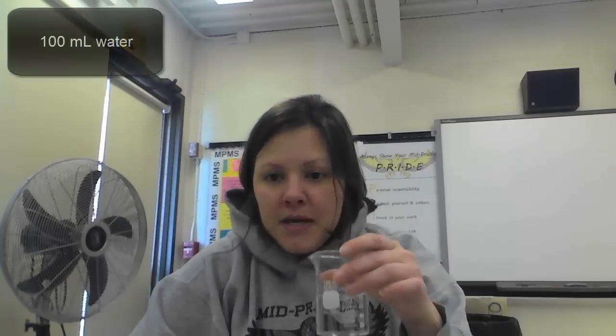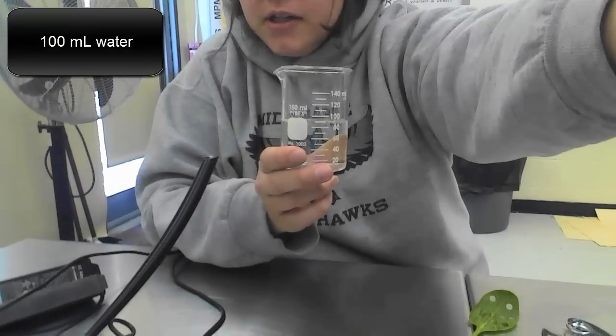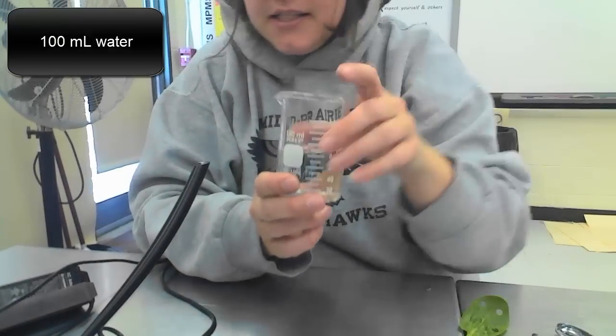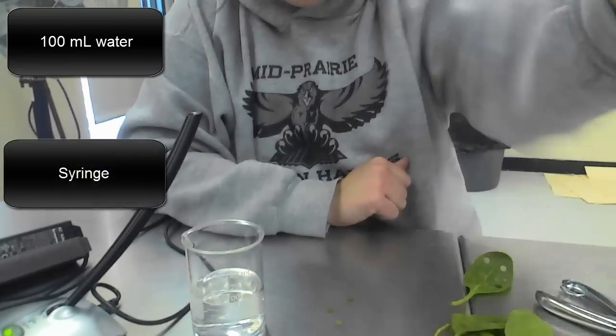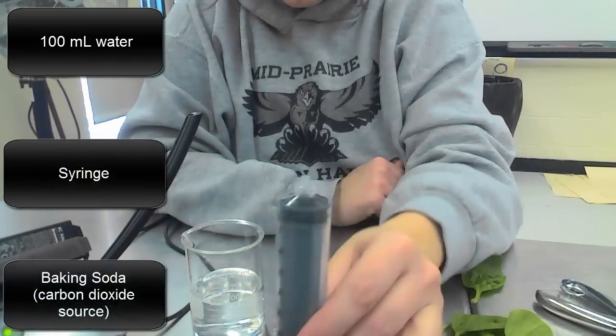Hey guys, what we're going to be doing today is getting ready for our photosynthesis lab. You're going to need to make sure you have several things in front of you when we get started. First thing you'll need is a beaker of water, so 100 milliliters. I'm going to put it at the table so you can see all my setup. You'll also need a syringe.